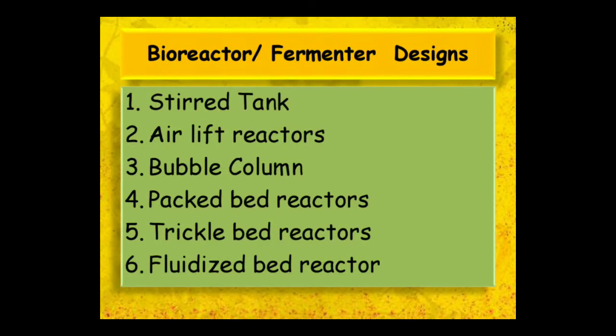There are several designs for a bioreactor or fermenter. Those are stirred tanks, airlift reactors, bubble column, packed bed reactors, trickle bed reactors, and fluidized bed reactors. So, here we will be discussing them.